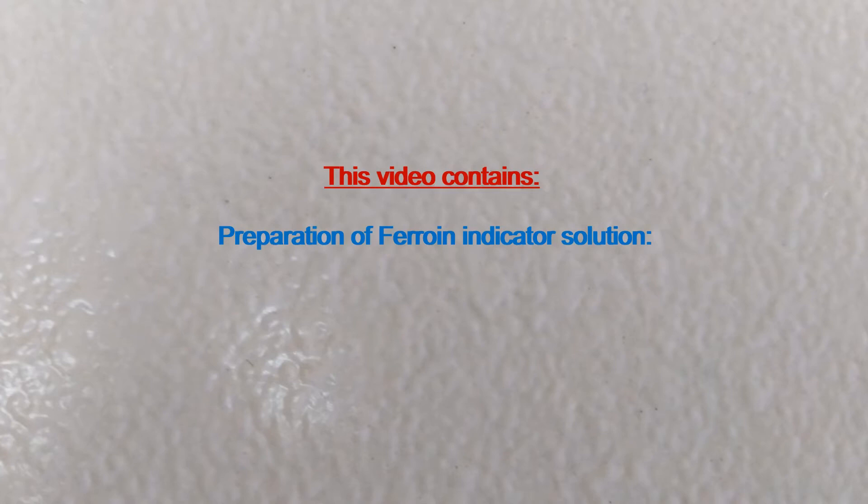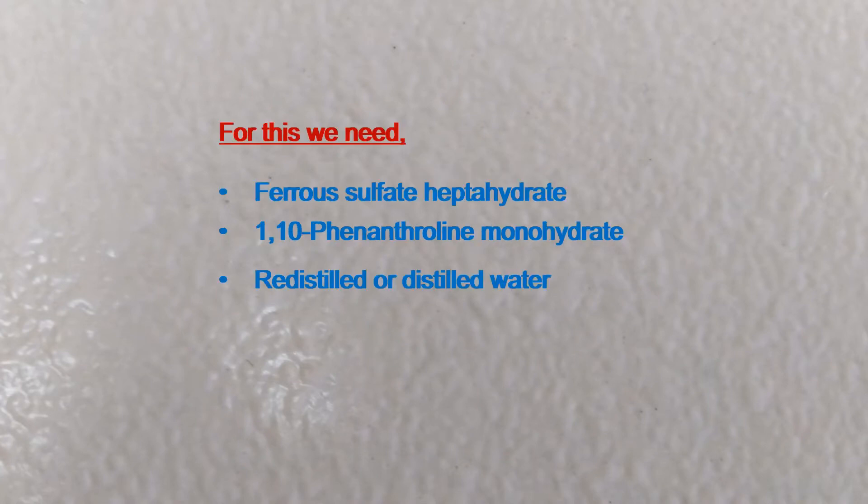This video contains preparation of Ferroin indicator solution. For this we need ferrous sulfate heptahydrate, 1,10-phenanthroline monohydrate, and redistilled or distilled water.